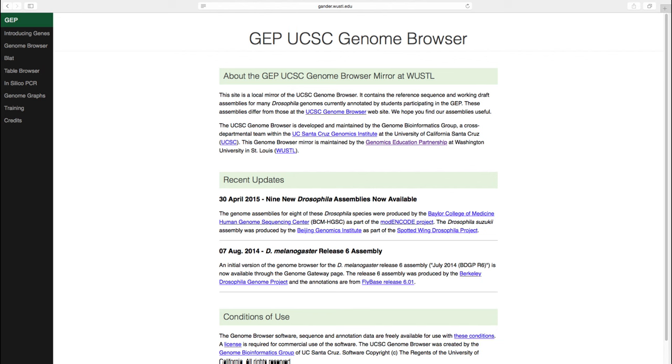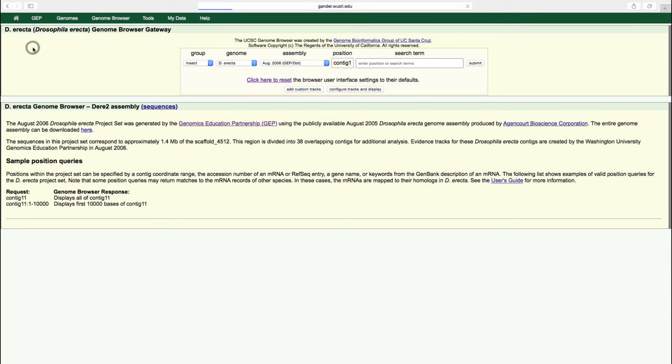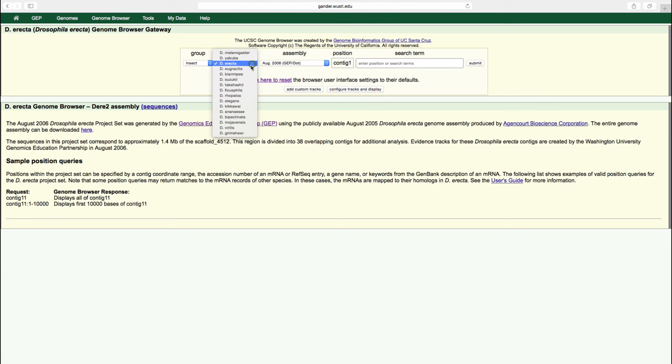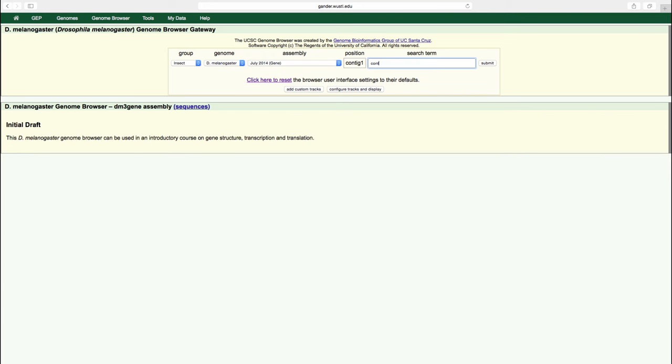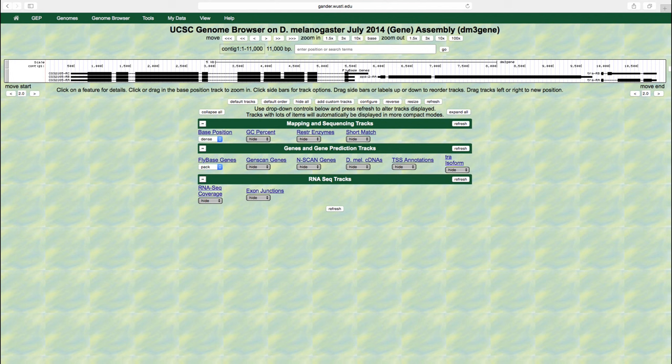We will use the genome browser to learn more about gene structure. Go to the GEP UCSC genome browser gateway page and select the D. melanogaster July 2014 gene assembly. Enter contig1 into the search term box and click submit. The default view shows the entire length of contig1, which consists of 11,000 nucleotides.